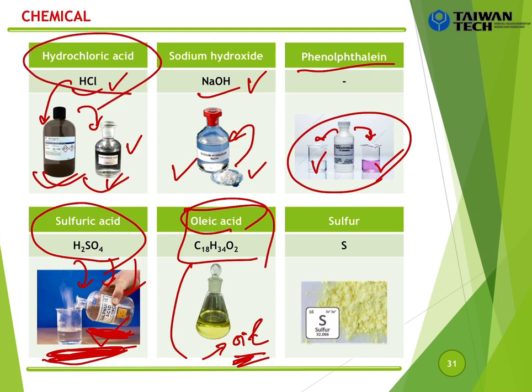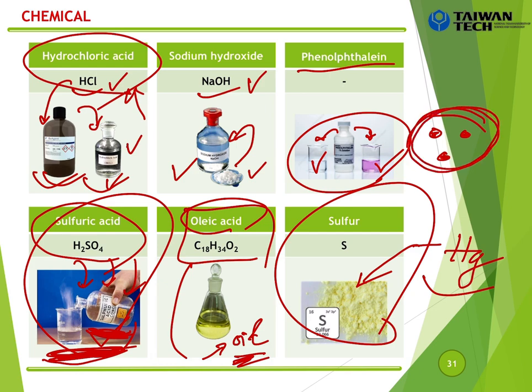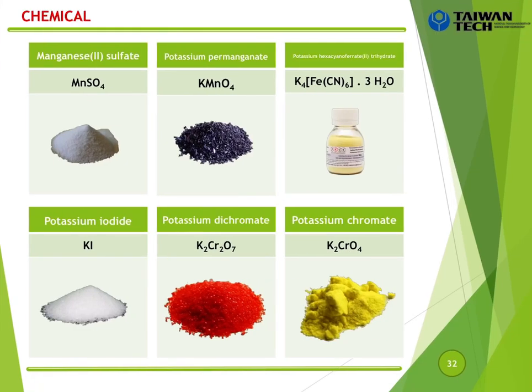But this one in your top match you have, but low concentration, high concentration, dangerous. And this one really dangerous, okay? Sulfur, this one just looks like one kind of element we have. And when we come to the lab, if something happens with the mercury from the thermometer, you should use the sulfur to collect mercury, because mercury will be particles like this, right? And then when you add the sulfur, sulfur can collect this, and it's easy for you to collect, and you can solve the problem, okay?